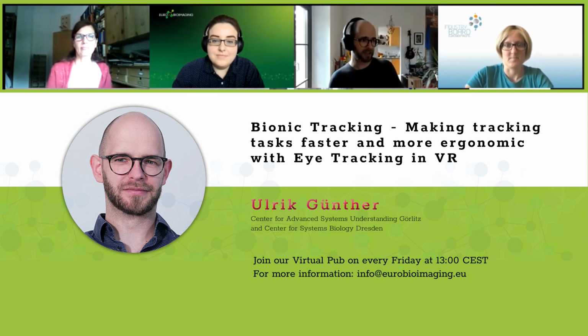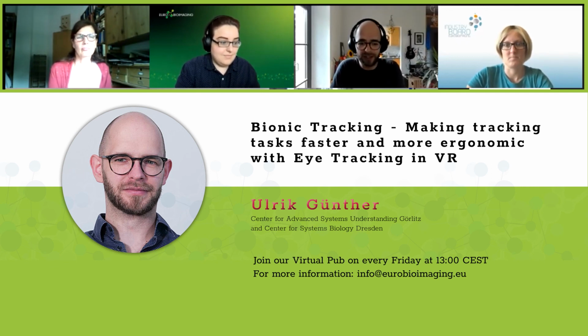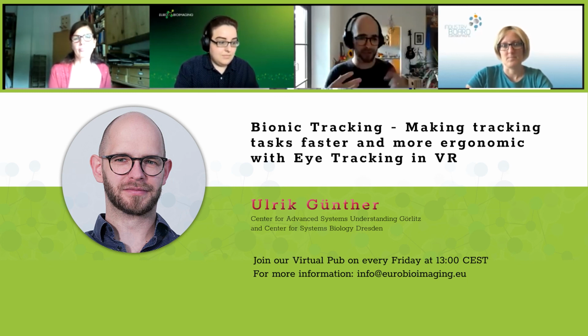And when it comes to reproducibility, this is a problem that doesn't just plague our approach, but that the cell tracking challenge people around Vladimir Ulman also had, because give 5 different people a data set to track, and you will end up with 5 different results. Nobody will exactly produce the same tracks, but you could, for example, imagine having a heat map where people mostly agreed or disagreed.